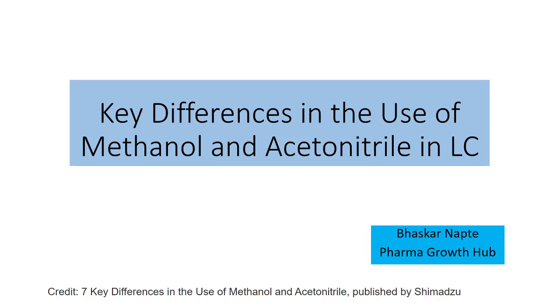Yes. There are certain differences, and that is the purpose of making this video. Now, this particular presentation is also influenced by the article published by Shimadzu. The name of the article is 7 key differences in the use of methanol and acetonitrile. So, the credit also goes to this article.